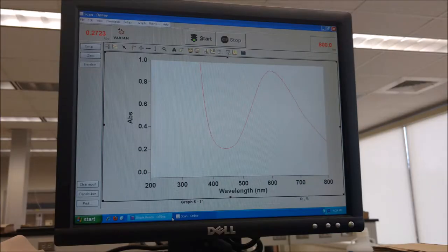When initially measuring absorbance, scan across all wavelengths to get the precise wavelength that needs to be used, as well as noting the lambda max, the peak of the wavelength. Lambda max is desirable, but it doesn't account for the dilution, so you must use 520 nanometers for the wavelength.